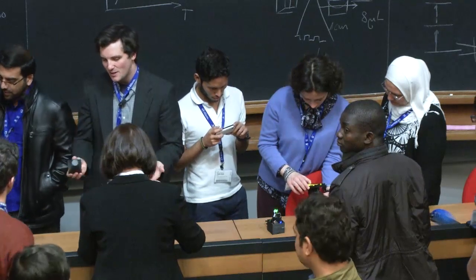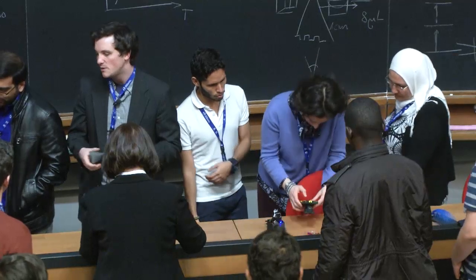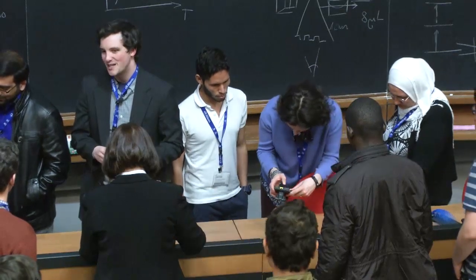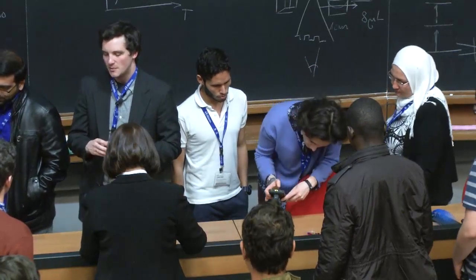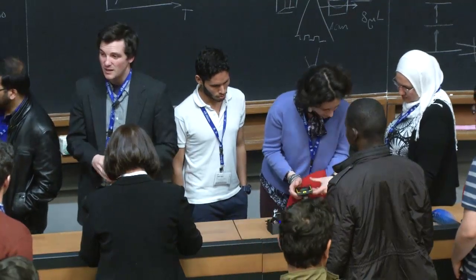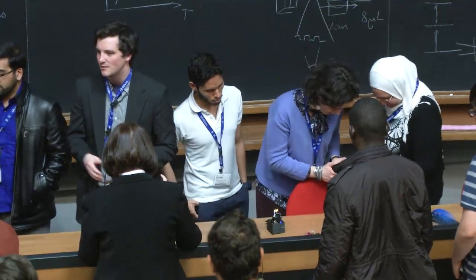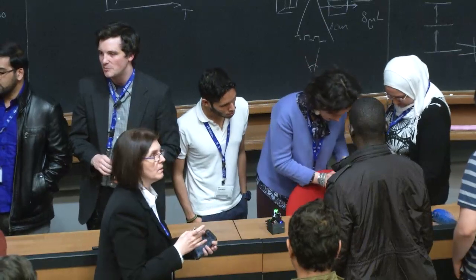But if you were to make one of these with a MakerBot type printer, which we do have in the lab, there's a lot of problems that come up. The plastic warps, there's not as high resolution. But maybe for the transmission-based microscope, maybe it would be fine. And hey, it's great if people are trying, even if it's not with the absolute best materials.